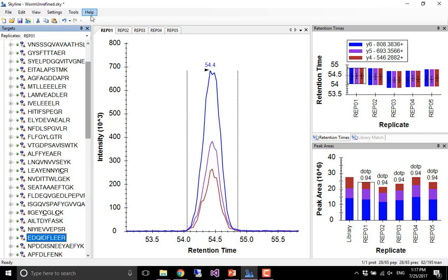But just a quick orientation, there are two steps to doing this. There's a one-time setup where you tell Skyline what Panorama server you want to talk to, and you give it your credentials to log in, because anytime you're talking to Panorama, you're doing that as a given user. You might be an anonymous user because that data is publicly accessible and you can download it and browse it. But on pretty much any installation, you're not going to be able to upload data without having an account that has permission.